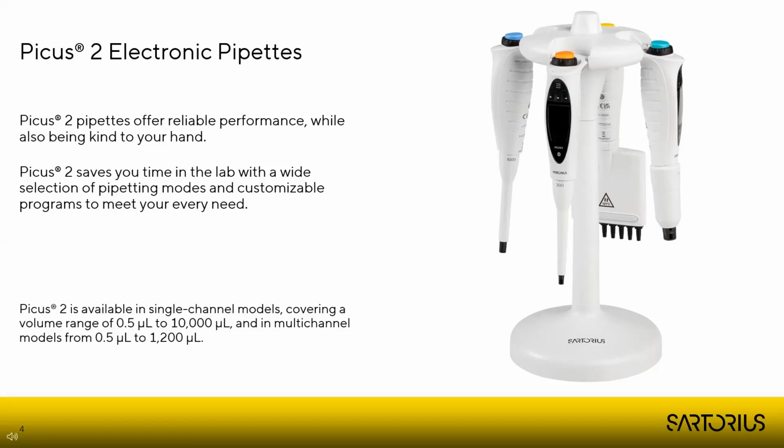Most laboratories that I've seen have maybe a couple of dozens of pipettes, but maybe just a handful of electronic pipettes. Two of the main reasons I've seen over the years why people switch to electronic pipettes are productivity and maybe ergonomic problems with the prolonged use of mechanical pipettes. Usually, electronic pipettes are used to increase the throughput of an experiment, especially when filling multitudes of 96 or 384 well plates. The second adaptation reason are the employees that might have injuries due to heavy pipetting, so they switch to electronic pipettes where it's much lighter for the thumbs specifically.